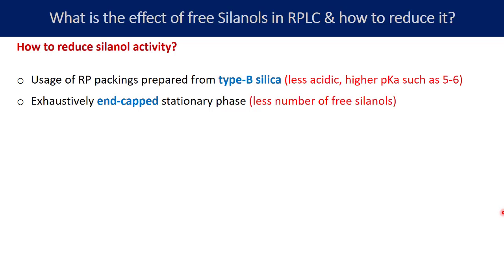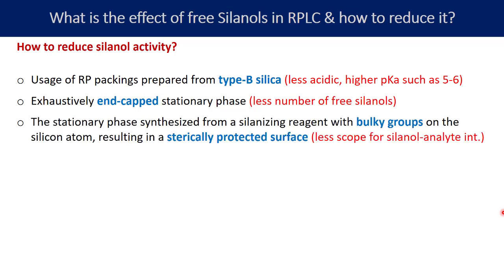Third, the stationary phase can be synthesized from a silanizing agent with bulky groups on the silicon atom, resulting in a sterically protected surface. The steric hindrance will not allow the analyte to reach the available silanol groups, preventing silanol-analyte interaction. Bulky groups such as phenyl groups present on a C18 phase can certainly help in reducing the secondary silanol effect.